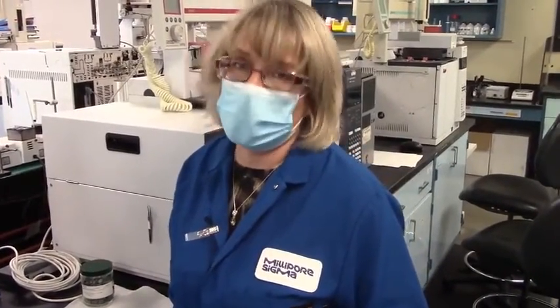As far as being quantitative, today what we did was qualitative, but the technique is definitely quantitative. It just involves a little bit more work because you have to prepare standards and extract them with your SPME fiber. But we have plenty of information on that, so please contact any one of our team members if you're interested in SPME or learning more about it, like quantitation or fiber choice or anything like that.